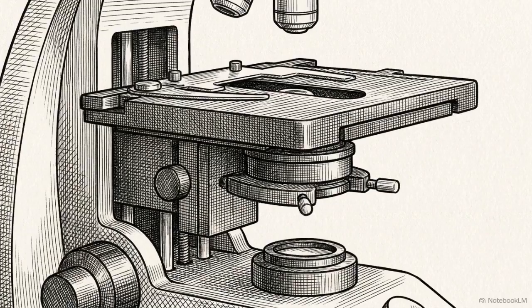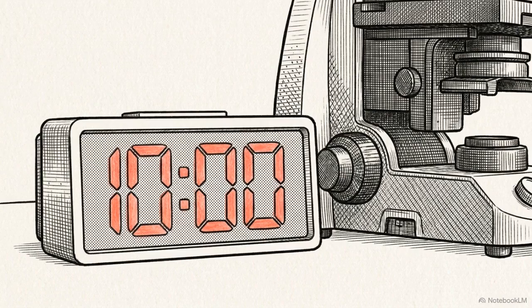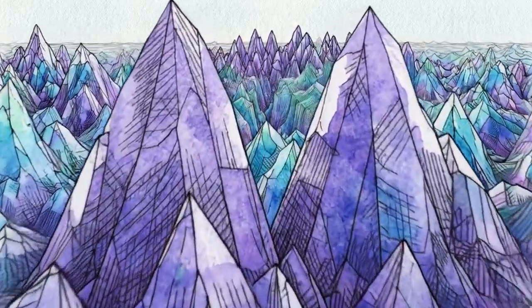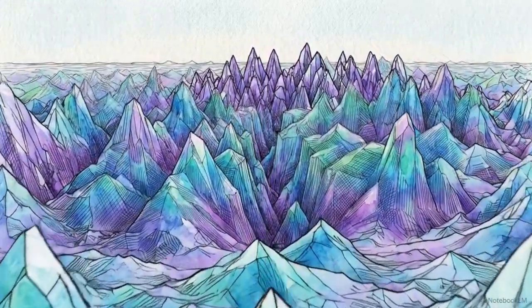One final check of the hardware. The stage completely lowered, the light dial reduced, and active cooling in progress. By utilizing the EFI protocol, you bypass the depth limitations of high-power microscopy, yielding clear, complete visual evidence for your work.